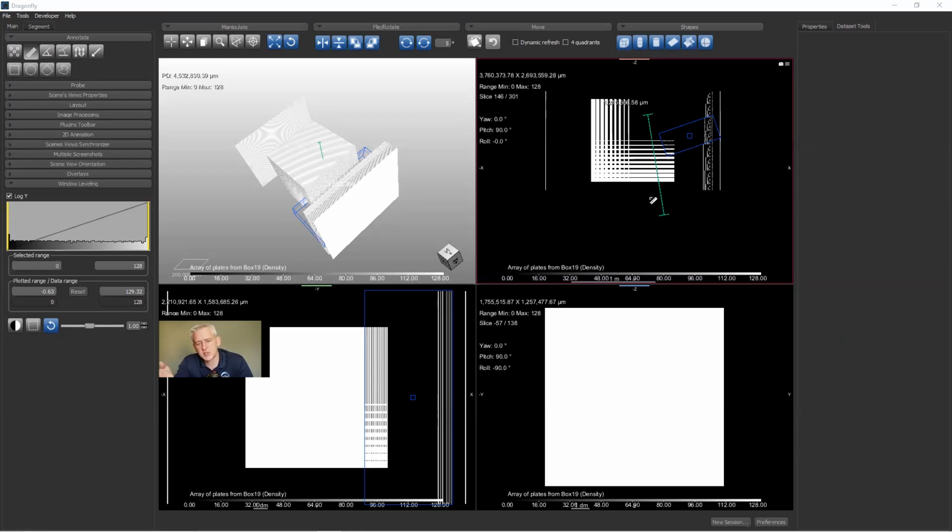I don't have time to do any examples. You could try it for yourself. It's going to take more compute power if you're resampling an image that's already large to a higher density grid or higher resolution grid. So it's going to take a lot of memory and some compute time, but you will get a higher fidelity copy of the rotated images.